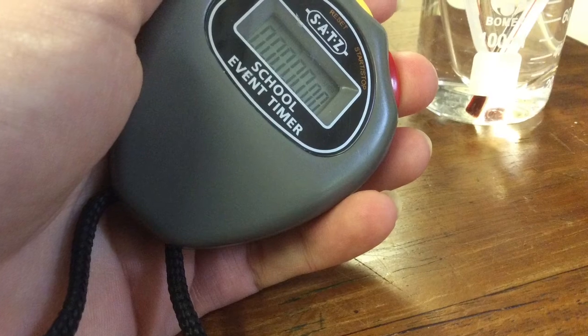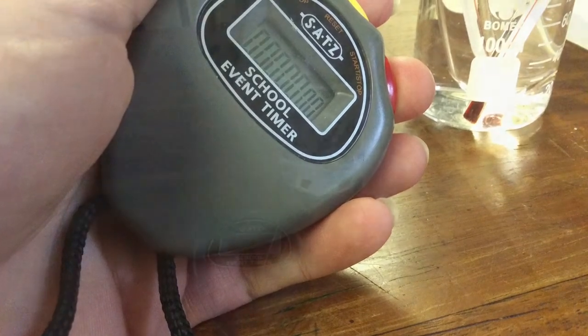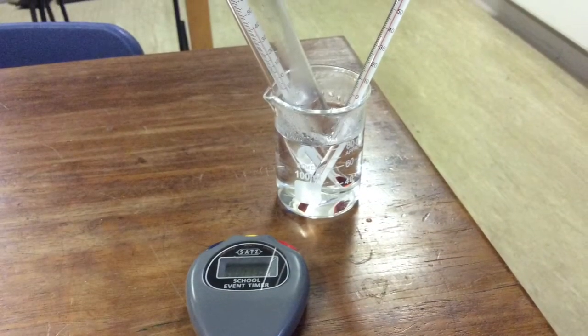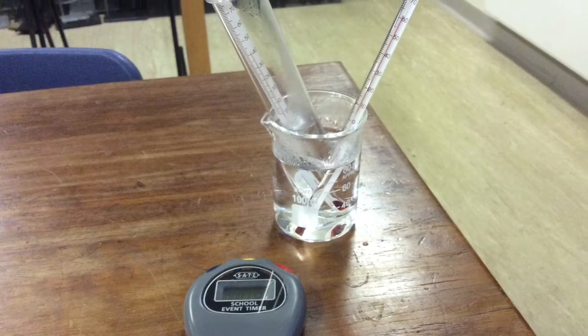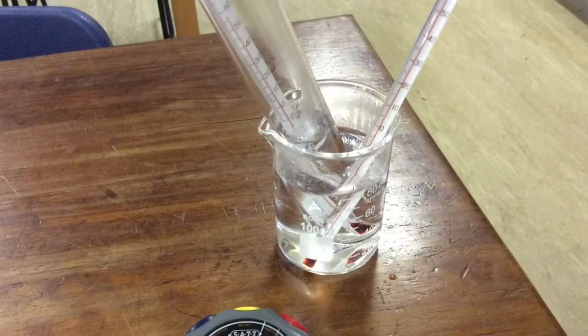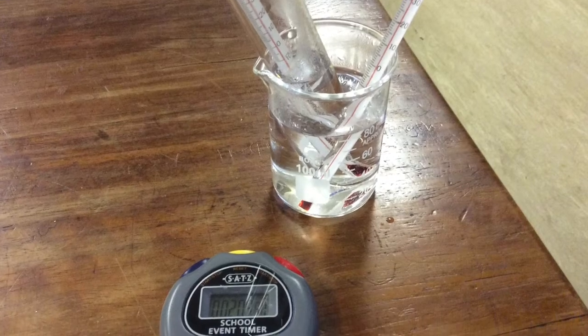Take your first set of results for zero and start the stopwatch. Do not stop the stopwatch. Use the stopwatch so you can take results every 15 or 20 seconds over the course of a few minutes.